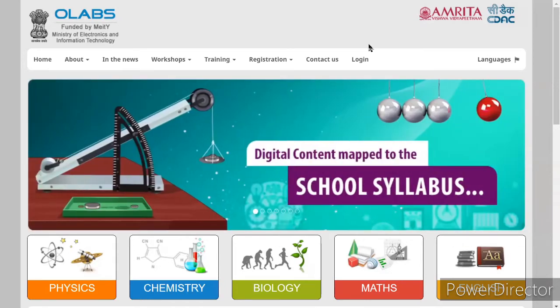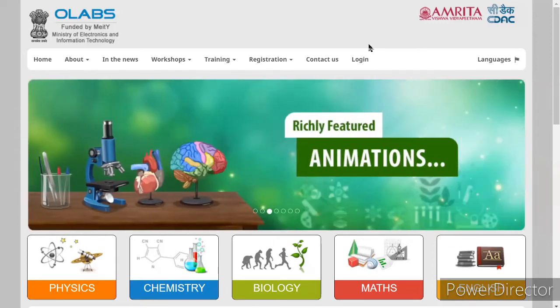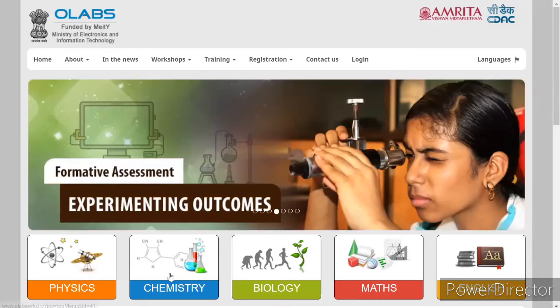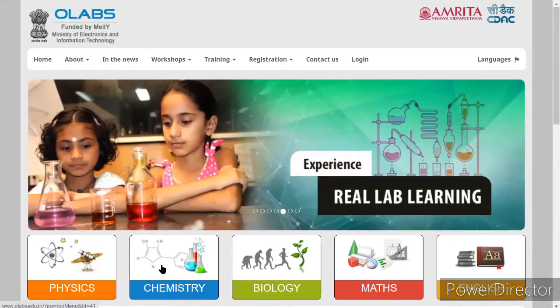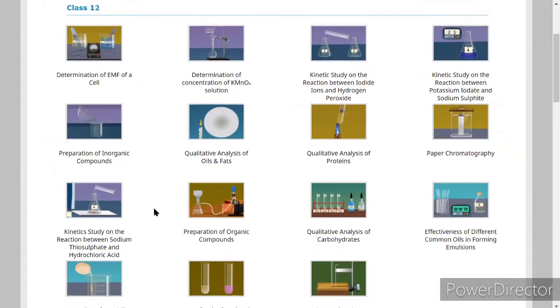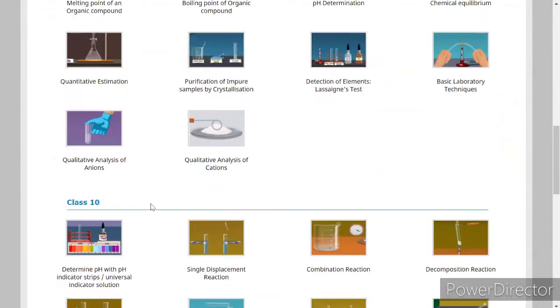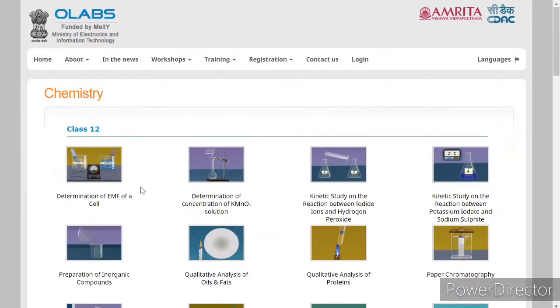This is our simulation video of a virtual laboratory experiment about reaction rate. In this simulation video, we use OLabs, or online virtual laboratory. Okay, so we will click the chemistry field related with our subject. These are the simulation videos that consist of grades 9, 10, 11, and also 12.